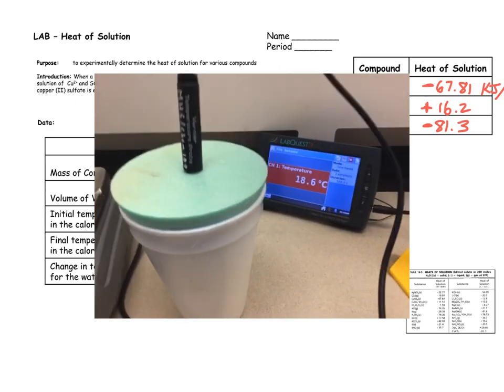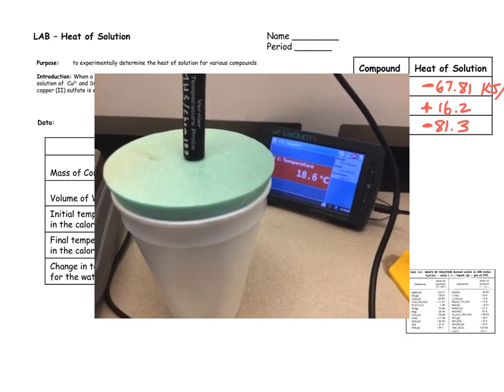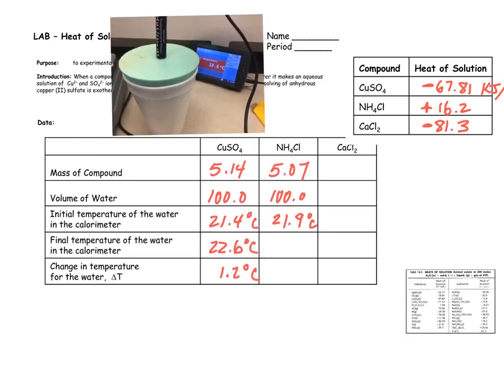All right, about a minute later, the water temperature now is 18.6 degrees. That will give a change of temperature of negative 3.3 degrees Celsius. The water temperature went down.